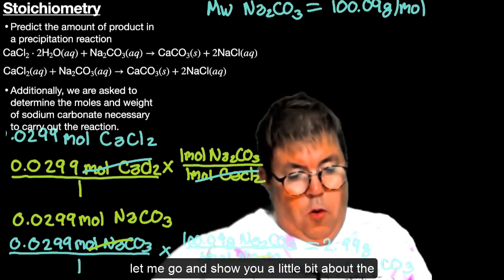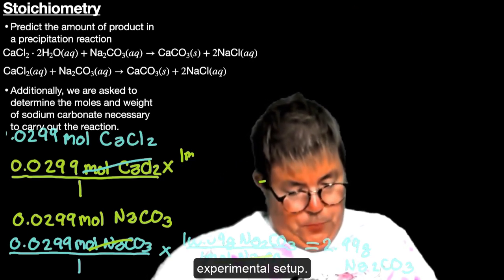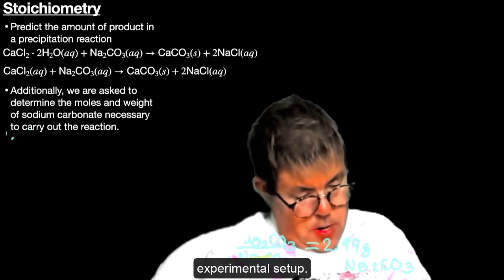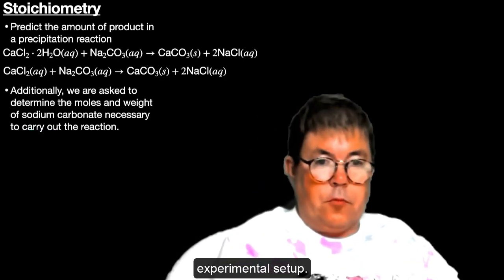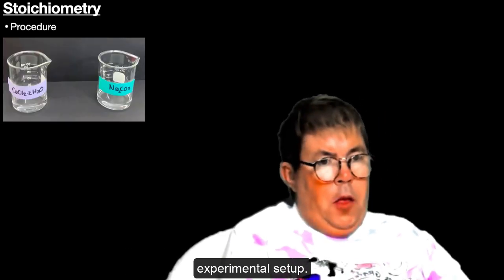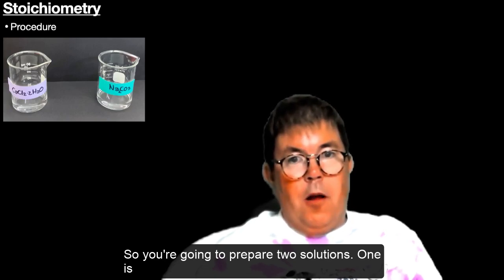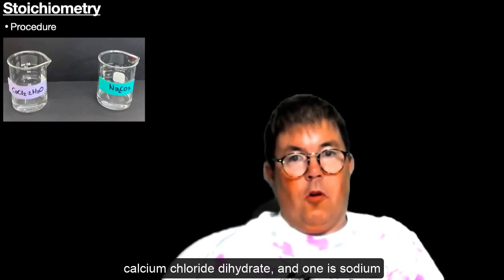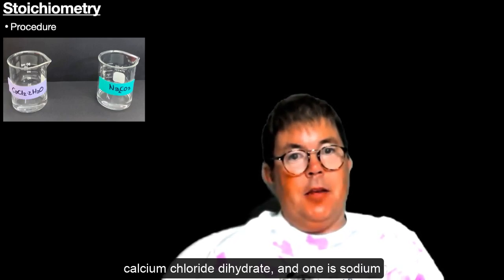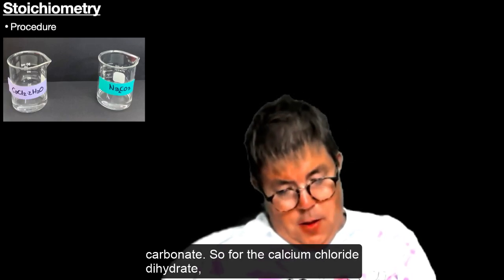Now let me show you a little bit about the experimental setup. You're going to prepare two solutions. One is calcium chloride dihydrate, and one is sodium carbonate.